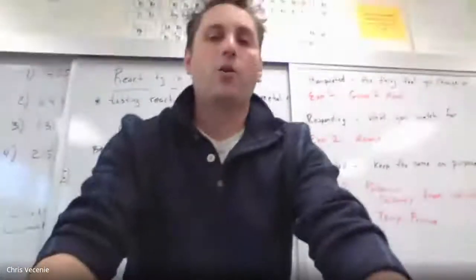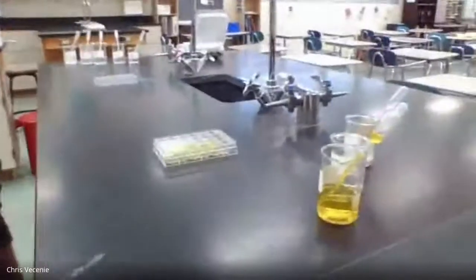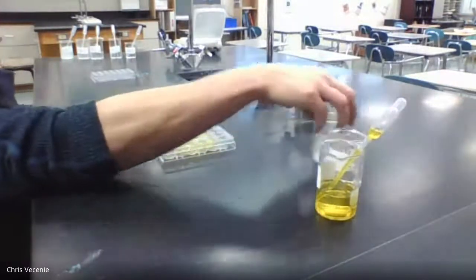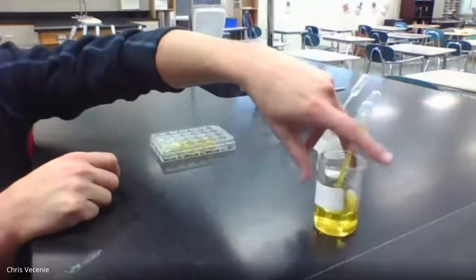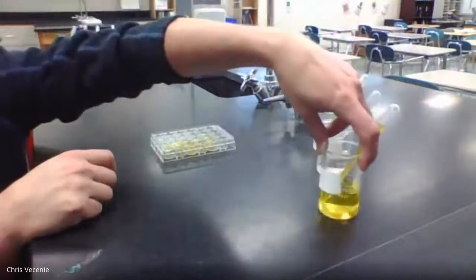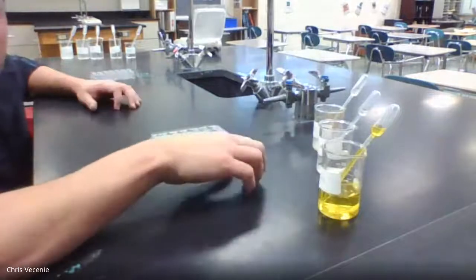All right, so I'm going to take you back to the lab and quickly walk you through what we do. Okay, I sent you guys over here. Tip it down. A couple things you'll see going on right over here. These are my three controlled variables. It's my carbonate for experiment 1, my sulfate for experiment 2, and my chromate for experiment 3. And if you take a look at those liquids, none of them have any solid in them. They would be what we describe as clear liquids, the first 2 being colorless, the third one being yellow.